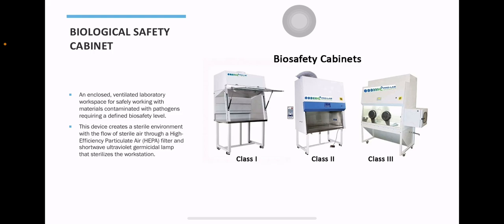So you can also change stations, and then it is not suitable for sterile work because the product is not protected. So please take note of this key idea for Class 1 BSC. It protects you and not the sample. Now let's proceed to the Class 2 BSC.